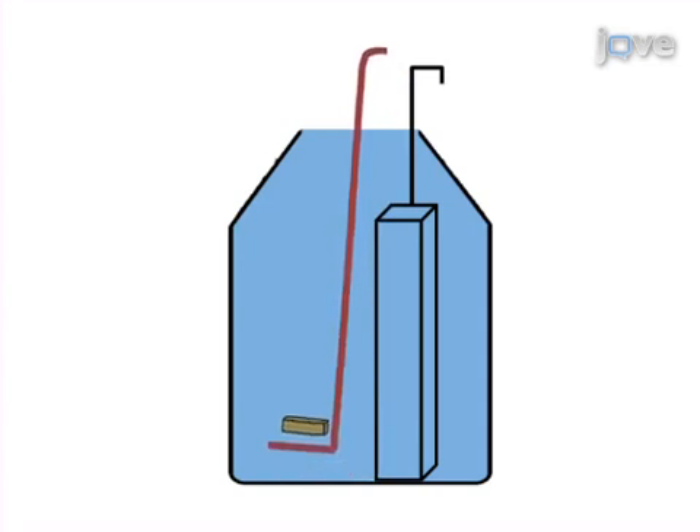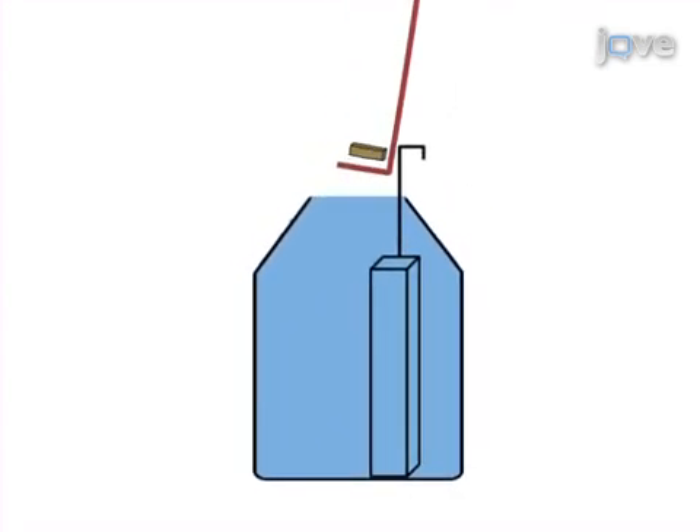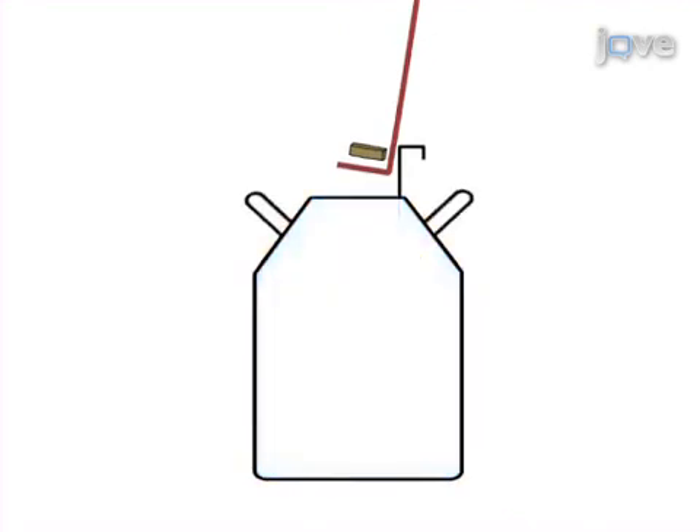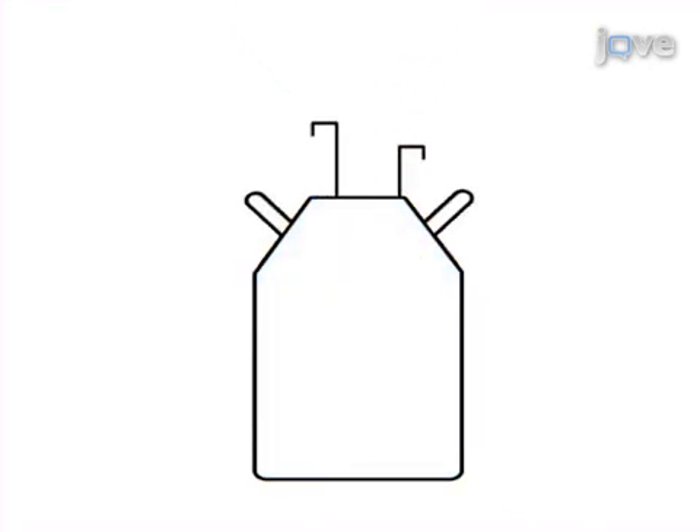Next, pull the device upright along the walls of the dewar to scoop the freezer box out of the tank. The final step is to grab the box retrieved from the bottom of the dewar and replace the removed freezer racks.